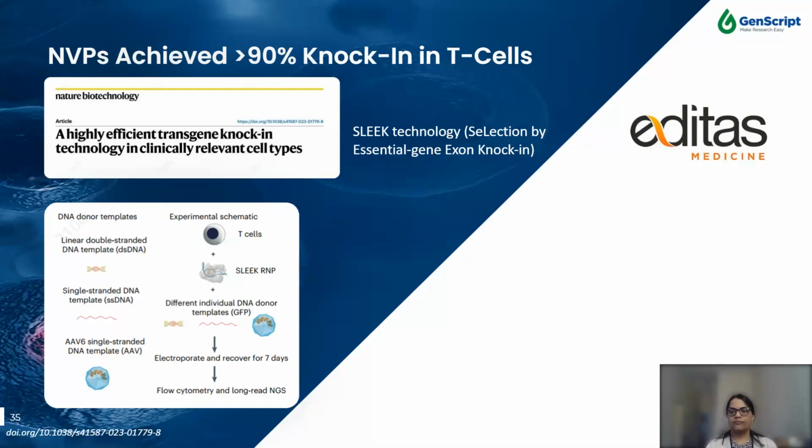For this figure, here they show how they did testing of non-viral DNA template with SLEEK, and for that they optimized the cell protocol for linear dsDNA and ssDNA template.